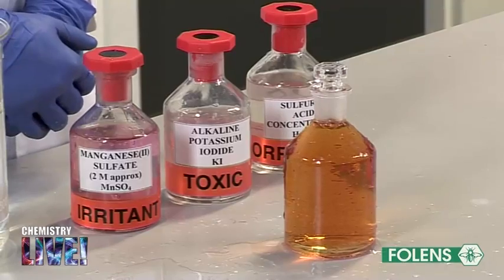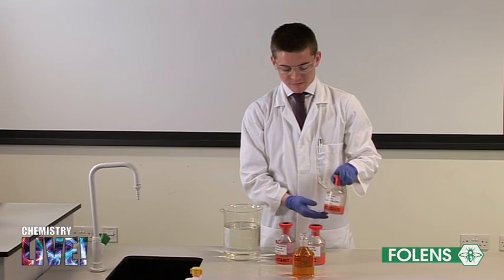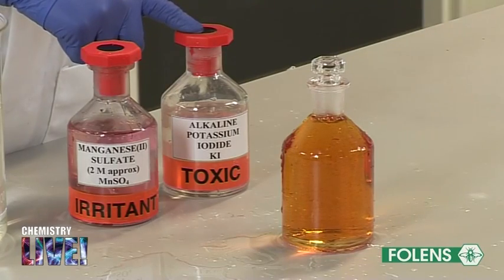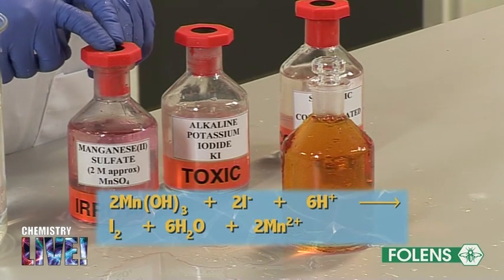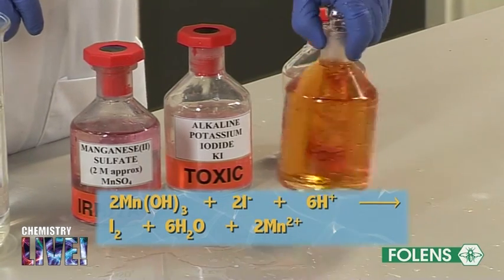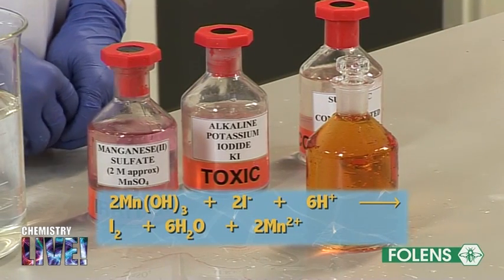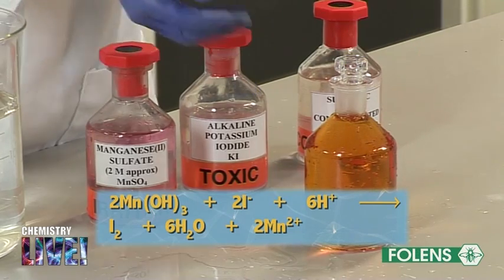The sulfuric acid added to the bottle causes the iodide ions from the alkaline KI to react with the manganese 3 hydroxide to liberate iodine. The equation for this reaction is shown on the screen. At this stage we can see the red-brown color due to the liberated iodine.